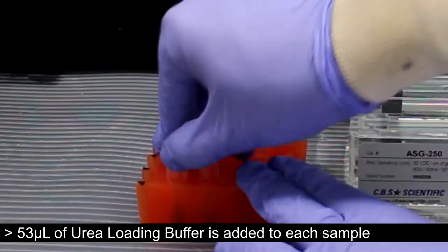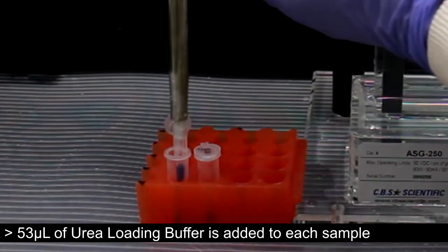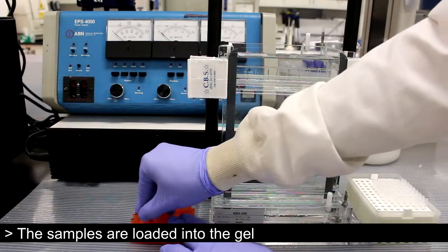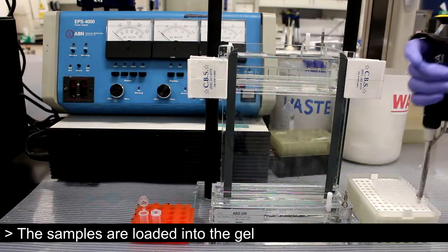53 microliters of urea loading buffer, or a 1 to 1 ratio of buffer to sample, is added to each sample. The samples are then loaded onto the gel.